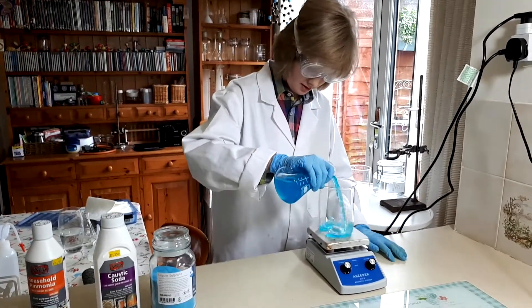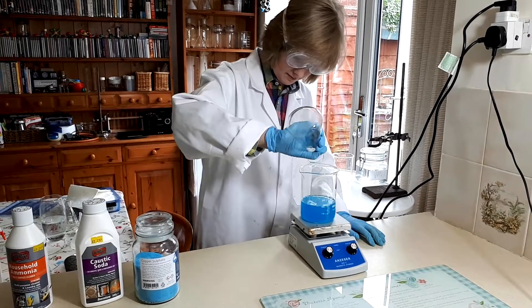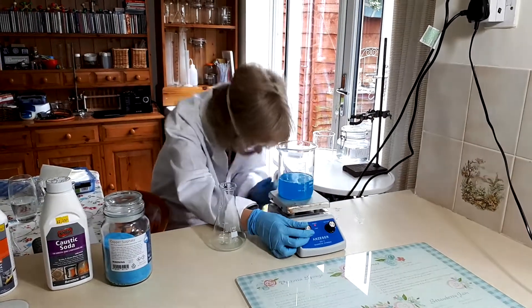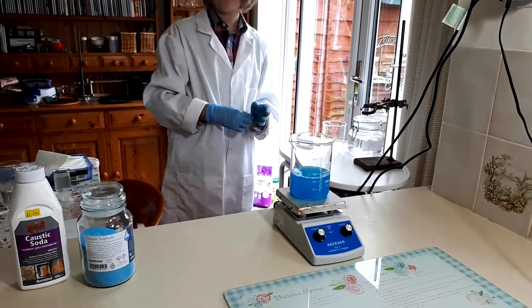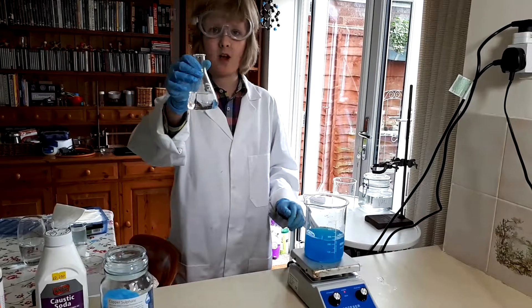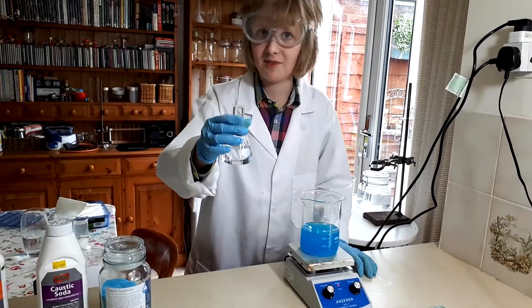What we can do is empty it into the beaker. With strong stirring, I'm going to add 75 millilitres of ammonia. If you're using lab grade 30% ammonia, then use only 25 millilitres.